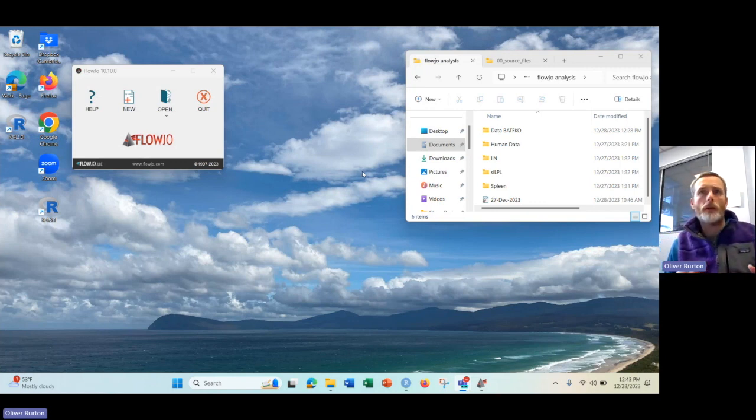While there are ways of doing this directly in R, they're decidedly clunky. So why not just use software like FCS Express or FlowJo that are really purpose-built for this? We want to do this exporting process because it allows us to focus the analysis on cells that we're interested in, which makes the analysis more sensitive and much faster than if we include everything.